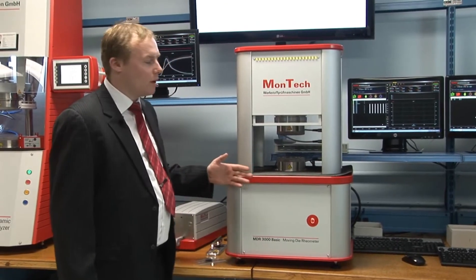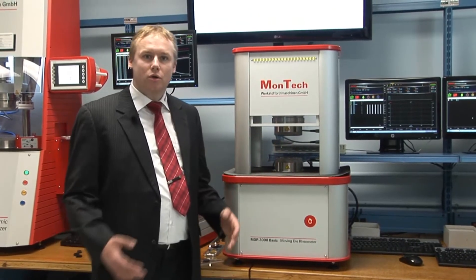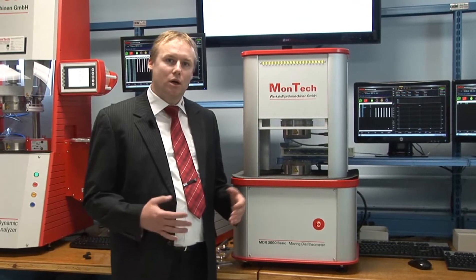Furthermore, the instrument comes with a computer and the MONTECH control software to set up test sequences, record data, as well as control and monitor the instrument.